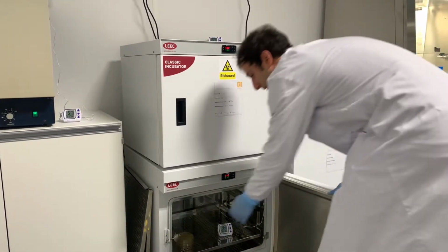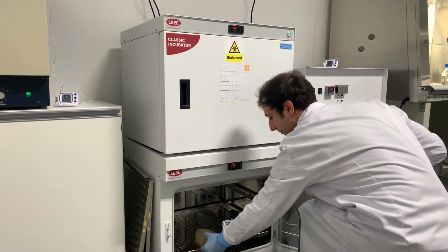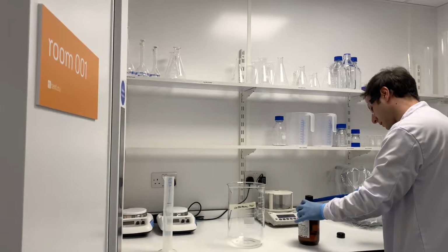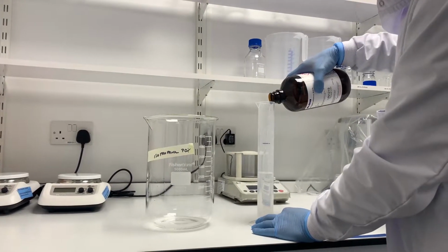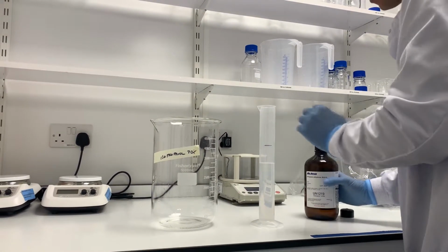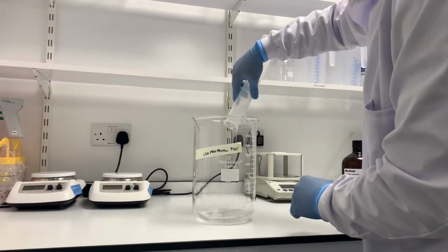The EN17272 standard was released last year, and it describes the methods for testing airborne room disinfection by automated processes. As most disinfectant standards, it all starts with culturing the microorganism of interest in advance of testing, so to have a fresh culture ready.